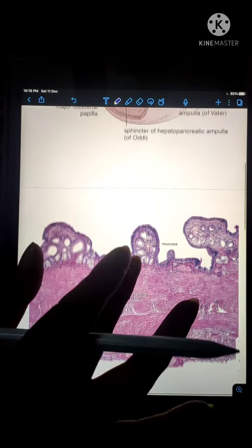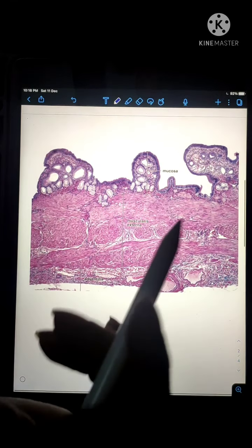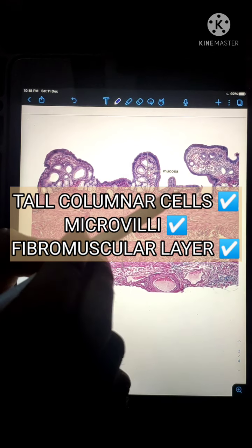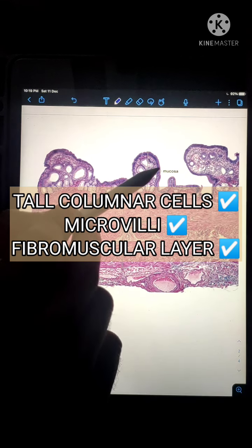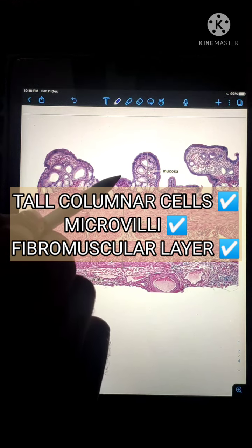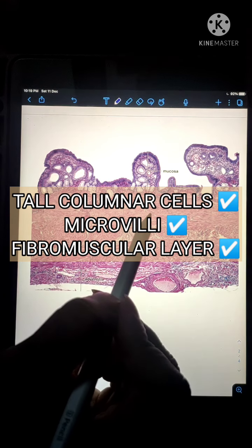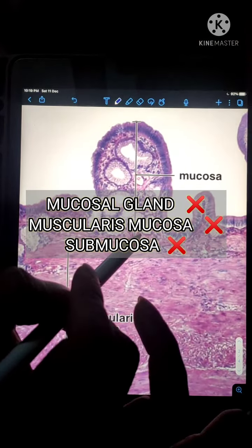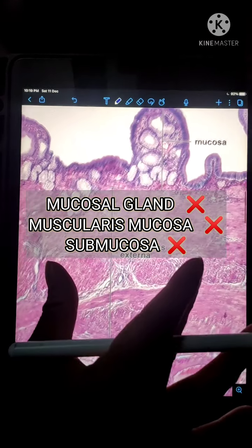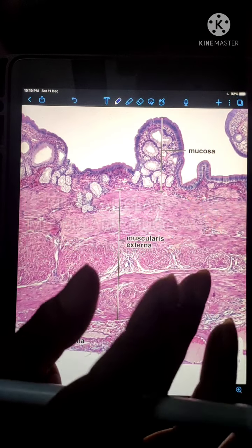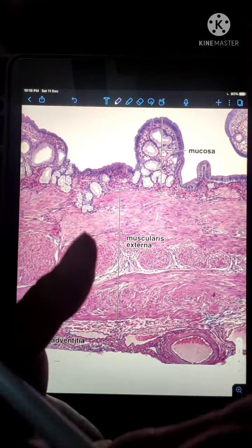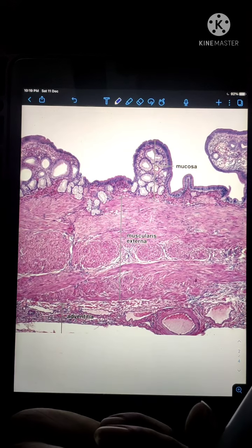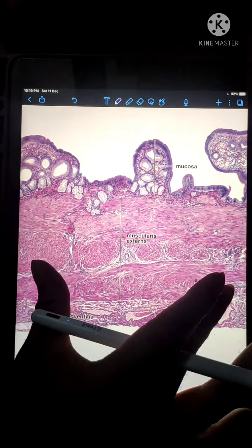To summarize, the gallbladder slide is not very complex. The key things to remember are that it does not have a submucosa or muscularis mucosa. It has numerous folds lined with tall columnar cells, similar to other parts of the GIT, but stands out due to the absence of mucosal glands and muscularis mucosa. The muscularis externa has randomly arranged smooth muscles, which allow the gallbladder to squeeze concentrated bile out through the cystic duct, into the common bile duct, and into the duodenum.